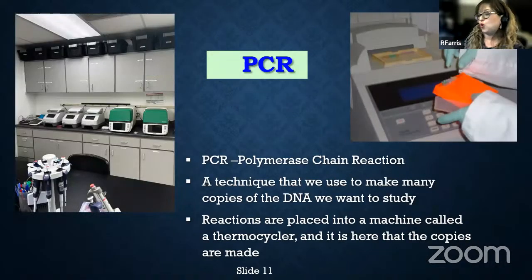All right, so once we do an extraction, the next step we would like to do is what's called a PCR. Now, I know many of you have heard the term PCR. It stands for polymerase chain reaction. And I know especially with this pandemic we had, you started hearing the term PCR probably a lot more often, because a lot of the diagnostics they were doing to determine whether or not you were positive for COVID were PCR diagnostics, all right? So that is a lot of what we do here at our laboratory.